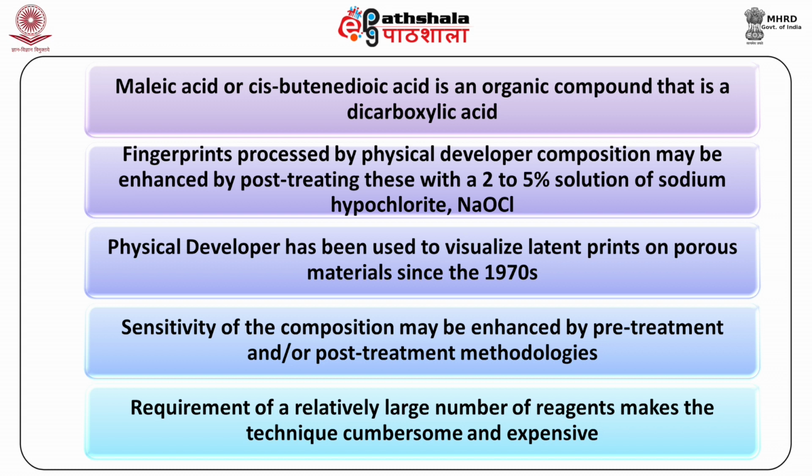Then, physical developer has been used to visualize latent prints on porous materials since the 1970s. Then we have learned that the sensitivity of the composition may be enhanced by pre-treatment and or post-treatment methodologies.